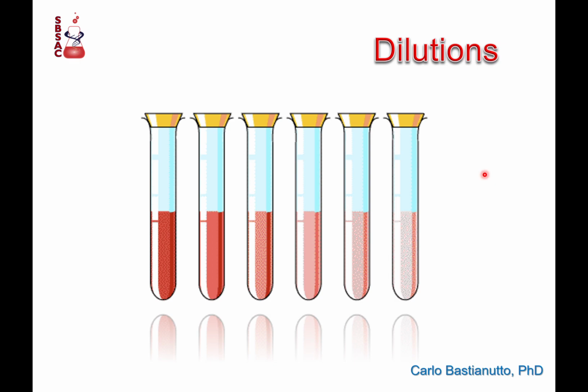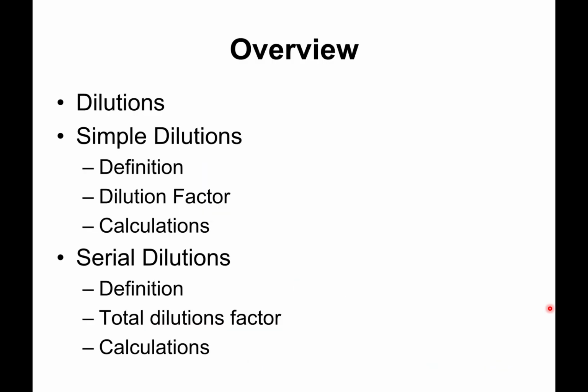Hello everyone. What we're going to be talking about in this tutorial is dilutions. Here are the topics we're going to touch in this brief lecture. We'll talk first of all about what dilutions are. We'll define what they are and what the dilution factors are. And then we'll focus on the two types of dilutions you can encounter in a lab.